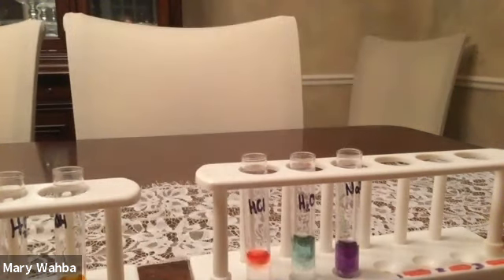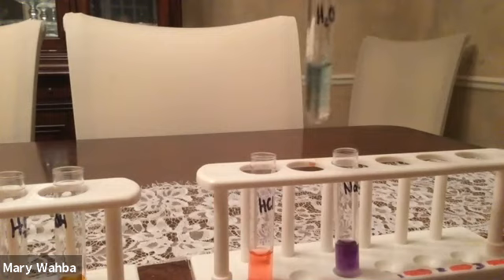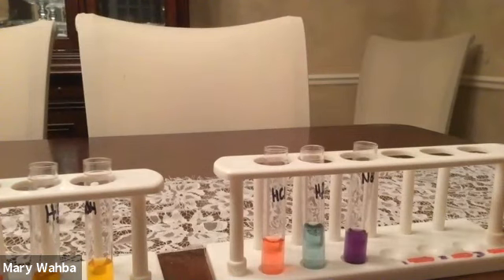And you'll see that in an acid, it's a red color. When it is neutral, it is a green color, and then in a base, it is a purple color. Now, in reality, like I said, it actually turns all colors of the rainbow. So green is neutral, it's pH of 7. But if you get a yellow or an orange or a red, those are all acidic. If you get a blue or a teal, blue, or purple, that would be a base.